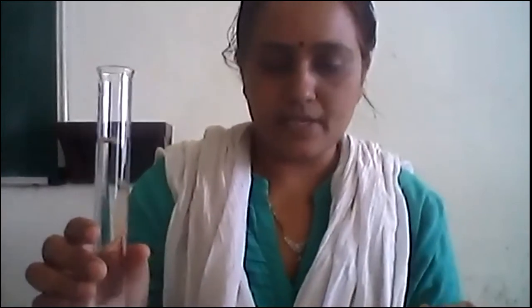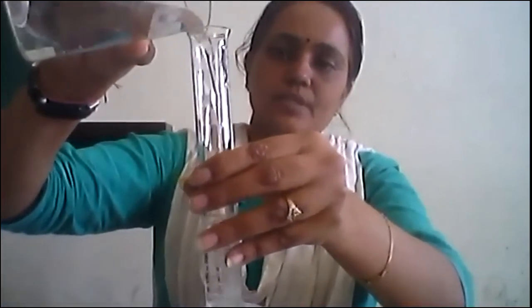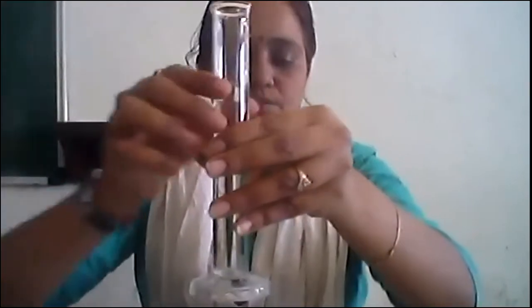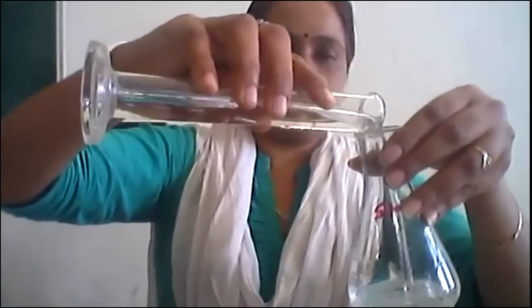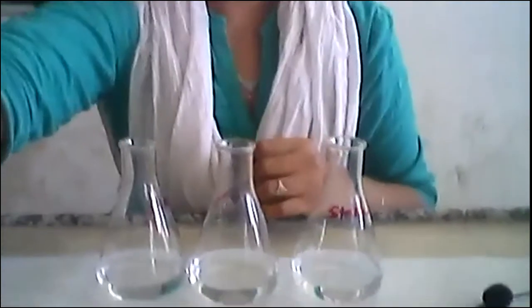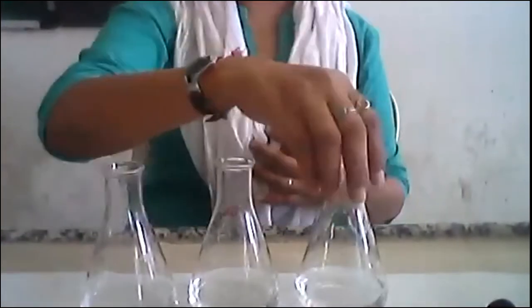This is 50 ml sodium sulphite I am going to add into each flask. Since we are taking the sample from the same initial condition, you can measure the zero-minute reading from any of these three flasks — the reading will be the same for all. So I will take the zero-minute reading from the static flask.